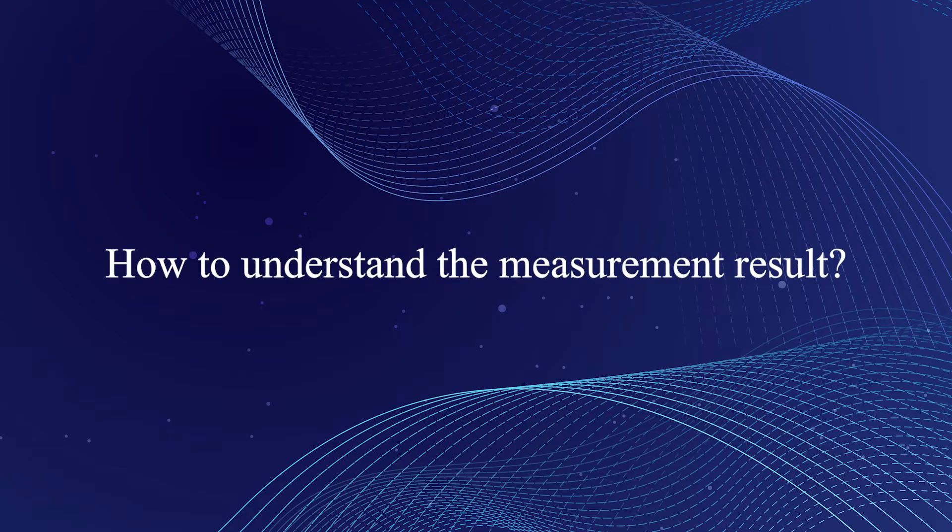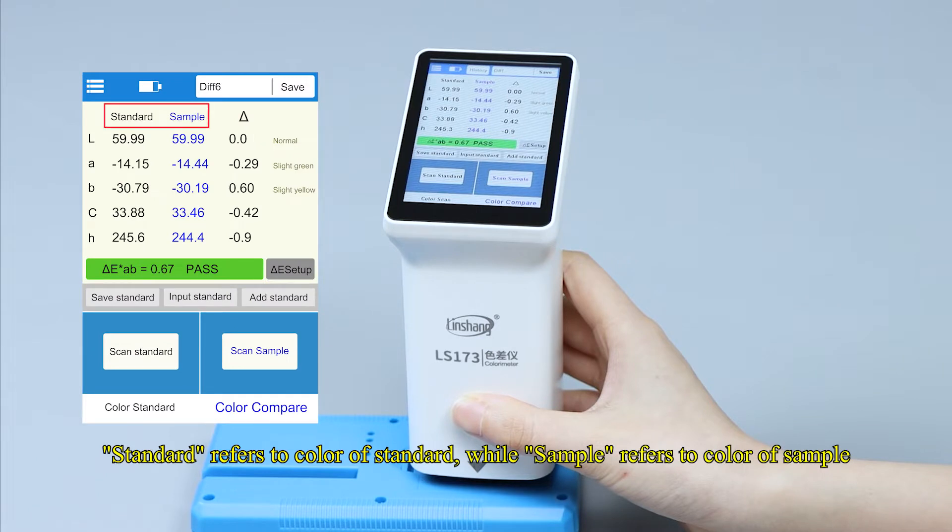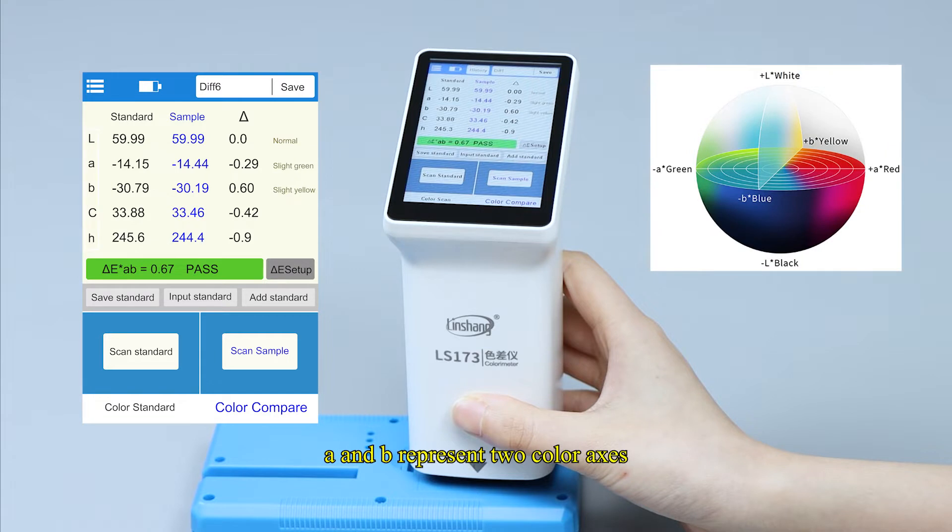How to understand the measurement result. Standard refers to color of standard, while sample refers to color of sample. L represents the brightness of the color. A and B represent two color axes. A represents the red-green channel of color. B represents the yellow-blue channel of color. C represents chroma and H represents hue.